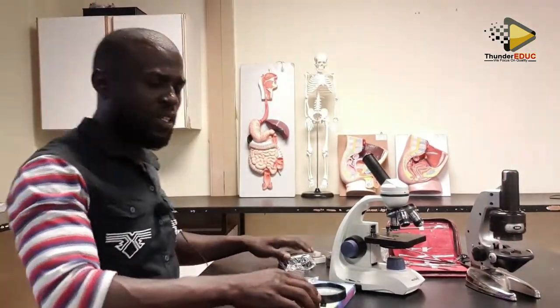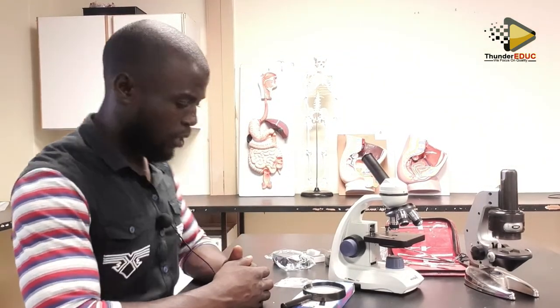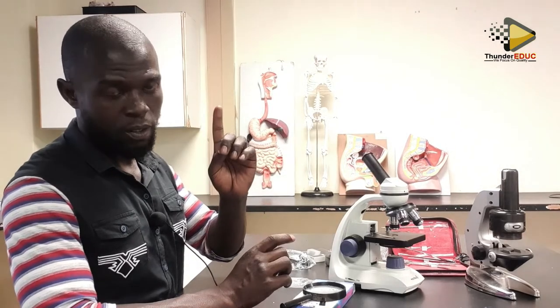All right, that's our business today. Our business today is the different kinds of microscopes based on their grades, how we label them, and how they come in the exam. We have two kinds of microscope. The first one is called the simple microscope. A simple microscope is a microscope made up of one lens.